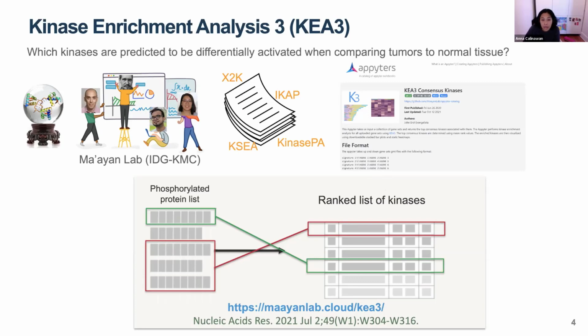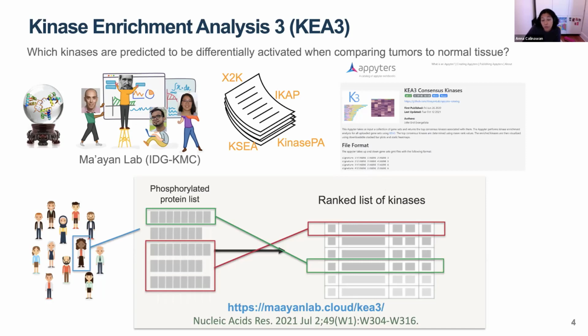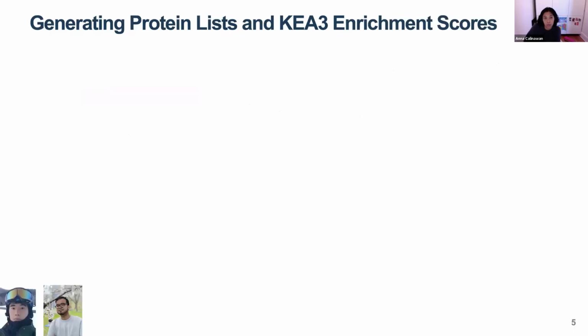The issue that we have for the CPTAC data is that we have a really broad, diverse set of cancers and a diverse set of cases. So in pursuit of personalized medicine, for a given case, how do we choose this phosphorylated protein list? That's what I'm going to go into next, with the pipeline that was performed by Weiping Ma and John L. Evangelista of Mount Sinai.